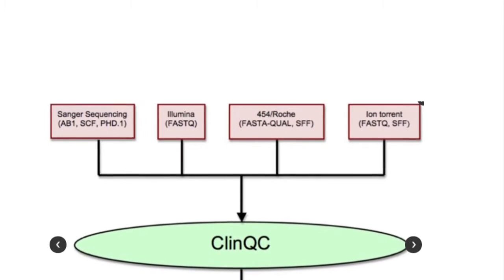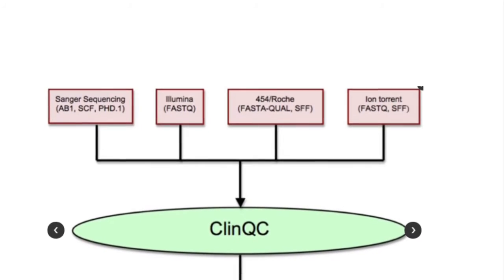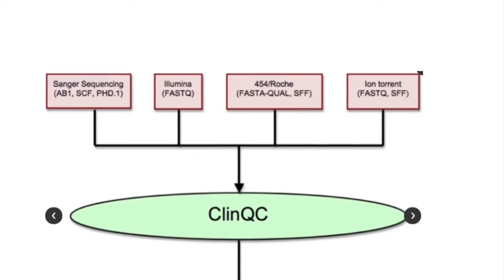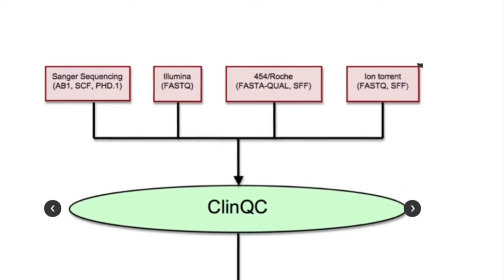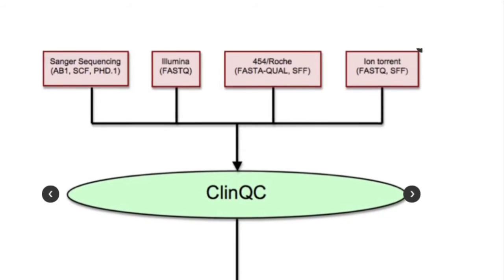The last one is pyrosequencing. It requires a preparation of single-stranded DNA molecules as a starting material. The advantage of pyrosequencing is that it can be automated to obtain hundreds of thousands of sequences in a single execution.